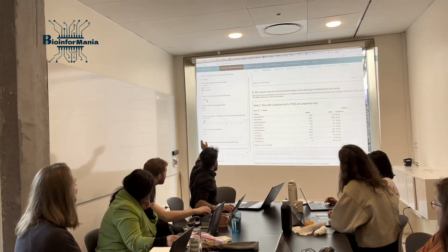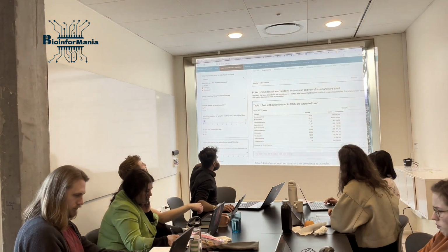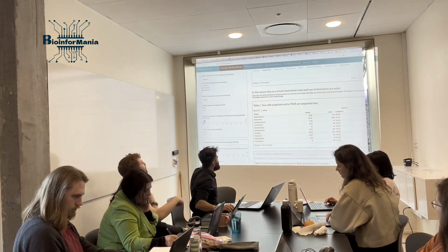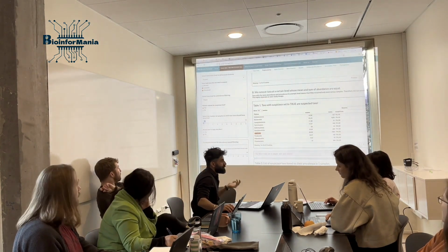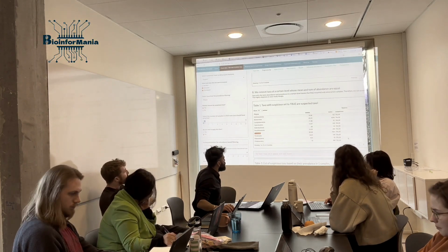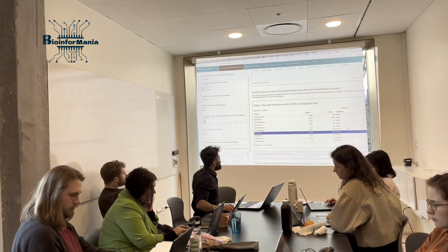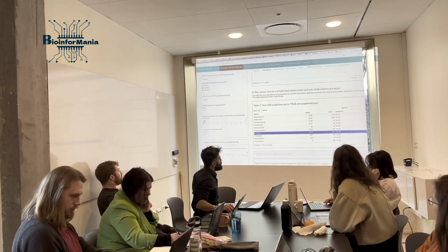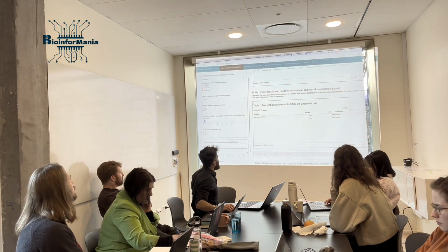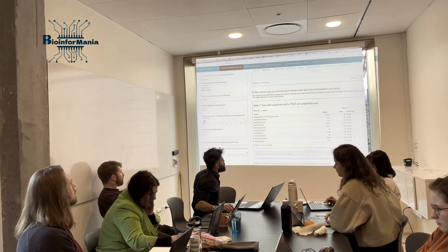This is also another algorithm for checking whether, at different taxonomy levels, you have some sequences that happen only once, and if so, you can remove them. Okay? Again, this decision is, you need to know what you're doing actually. So we set it to phylum level. You can also see if there's anything here suspicious true, then you can select this to remove or no. Mm-hmm. So we don't have any suspicious, but if you go, for example, to family level, let's see what happens.